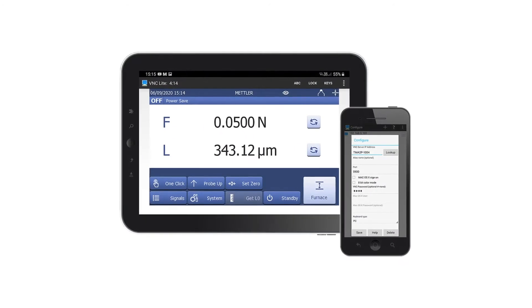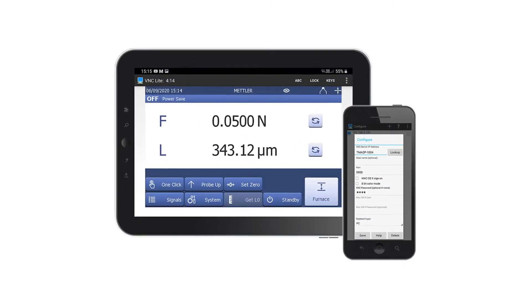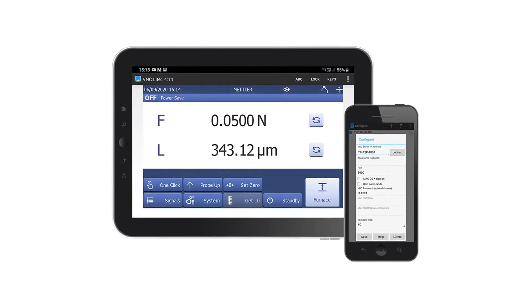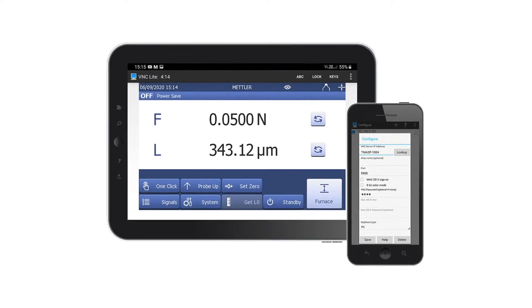In this video, we show you how to access the terminal of your STAR-E thermal analysis system from a smartphone.